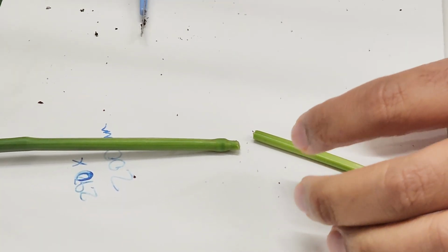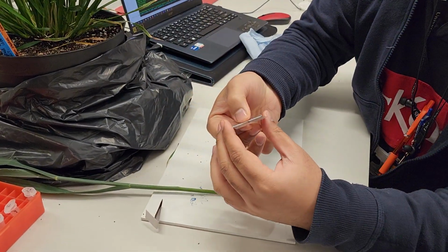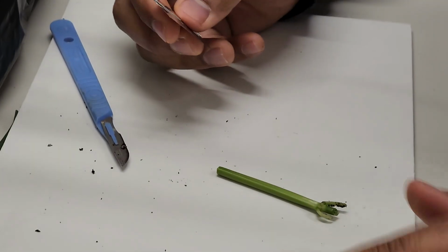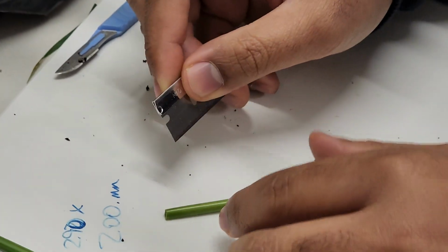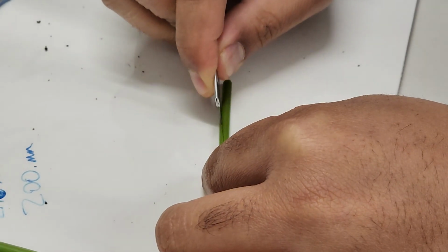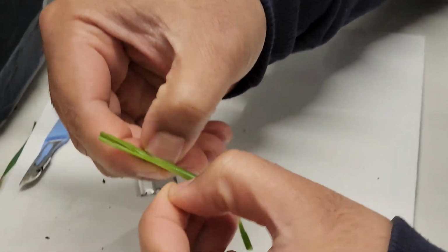Actually, you shouldn't be cutting with this. You need to use a proper blade, single edge blades that are made in USA. Okay. I just want to check. So this guy should have the meristem here. So let's open that. Please don't try this at home because you need to wear a glove and so on. I've been doing this for quite some time, so I sort of know what's going on.